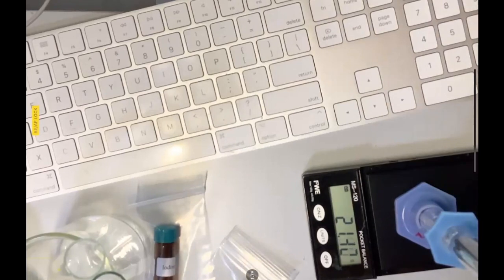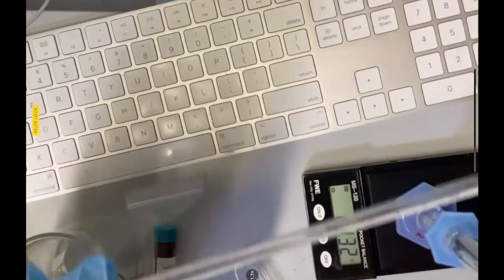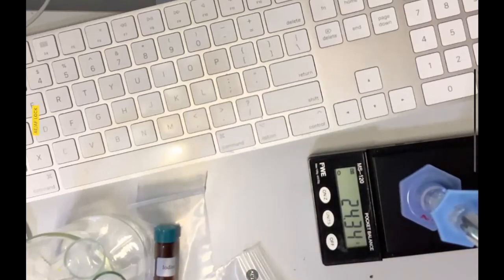If the liquid sticks, then you will need your glass stirring rod so that you can break the surface tension, and then make sure the liquid goes down. So I didn't pour it all, but I did pour enough. Even if your stirring rod is wet, it doesn't matter because that's not in the container. So now I can read the volume.